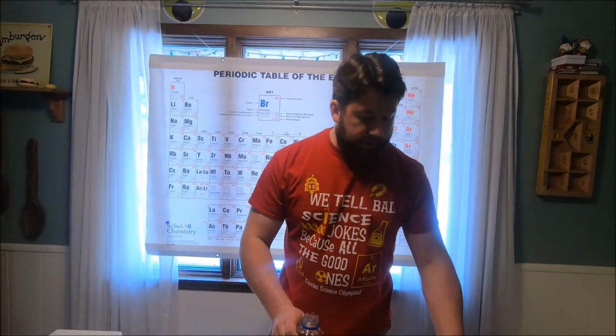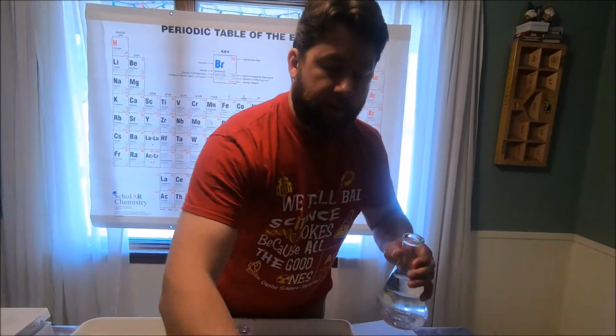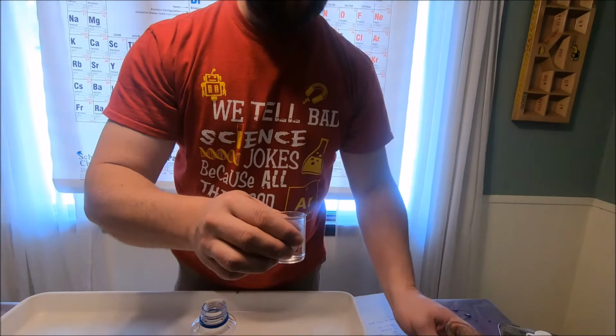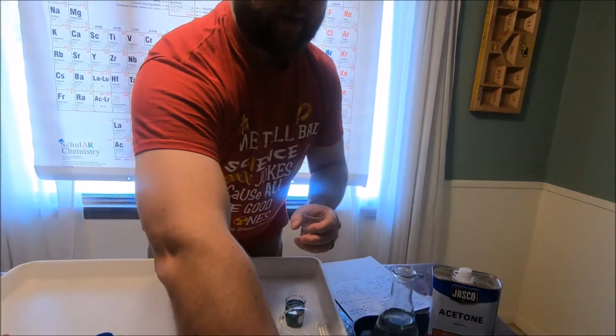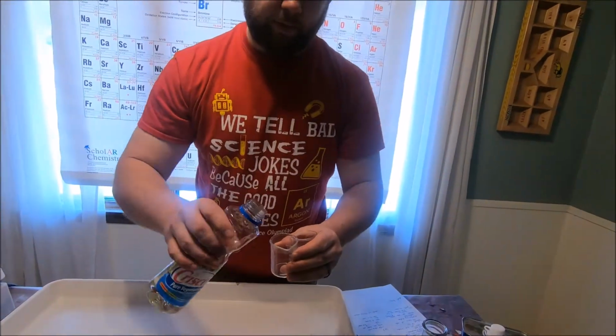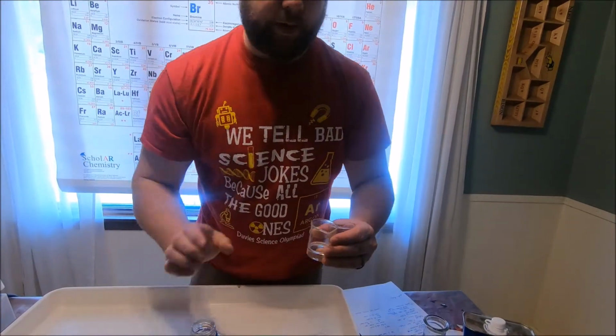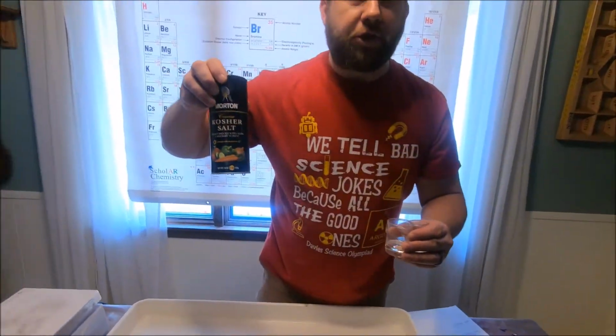So we're going to go back to that oil and water idea. I've got a little more water in one, and in our second beaker, we're going to put a little bit of oil. Now this time we're going to look at an ionic compound. Our ionic compound of choice is just salt.